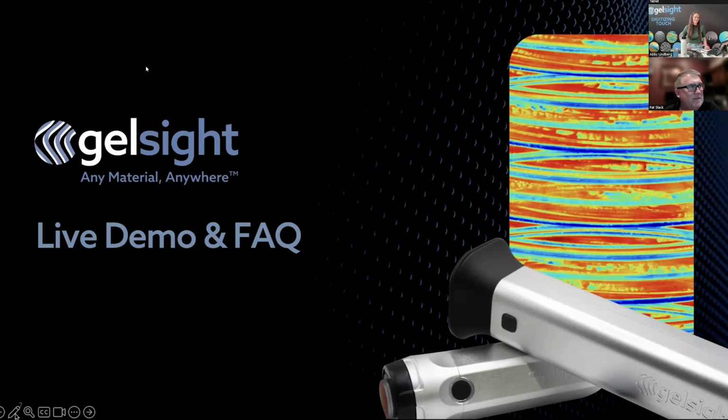Next question is, every once in a while between scans, my resolution will go completely blurry. I have to either restart or reselect my gel. Then it is fine. Is there a way to fix this? I'm assuming that you have a Series 2 system and it's an autofocus. Then you can basically just click on the screen to refocus the system. But if you want, you can connect with us offline. Just shoot us an email at support@gelsight.com and we can help you out.